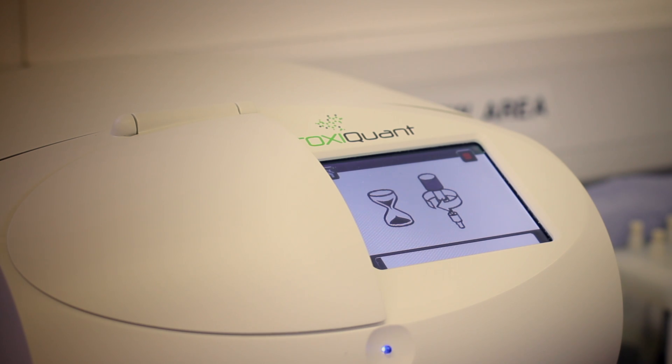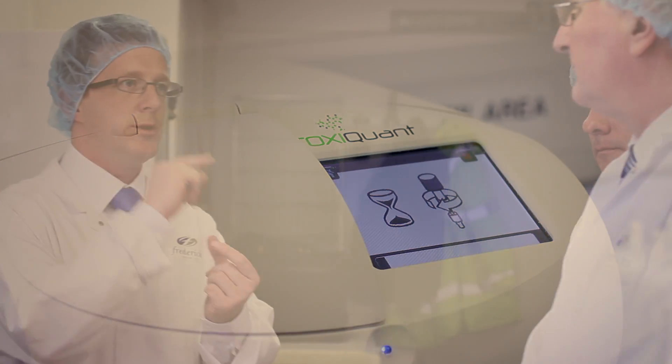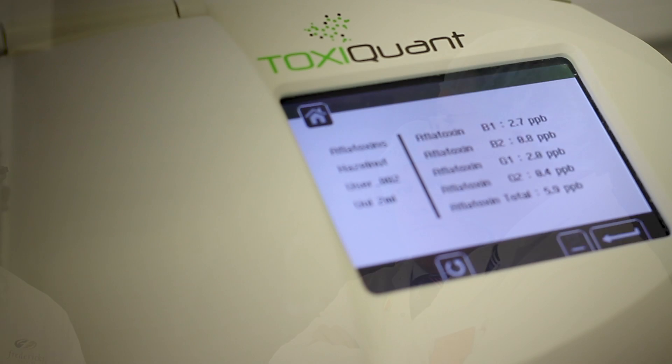As it's been explained before, the cartridge is being rotated and stepped up in fractions of a millimetre, so it reads the area where the aflatoxins have stuck to the cartridge. We've designed it to be usable and to work in dusty environments. It's a compact unit and hasn't got very many areas where you can get into it, so it's ideal from that point of view.